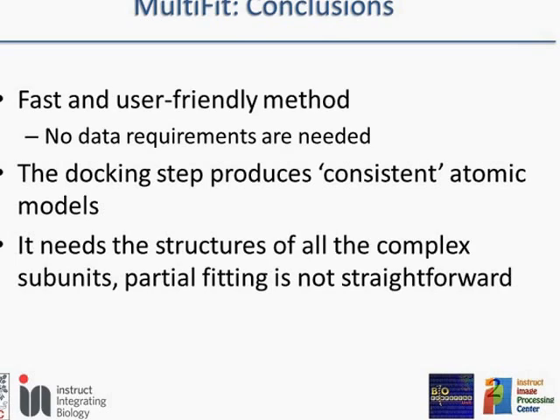Okay, so if used by default, it is quite fast, a very fast method. The data doesn't require any special treatment, just the PDB structures and the volume and everything, and the default options work quite well.